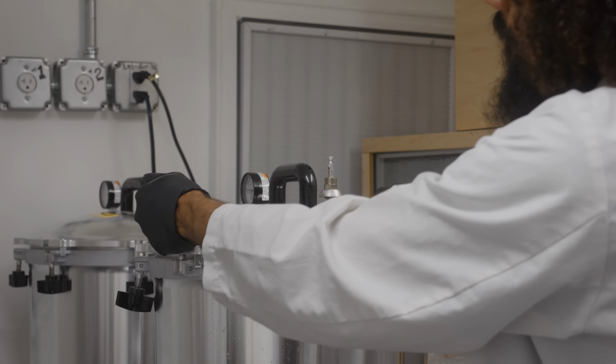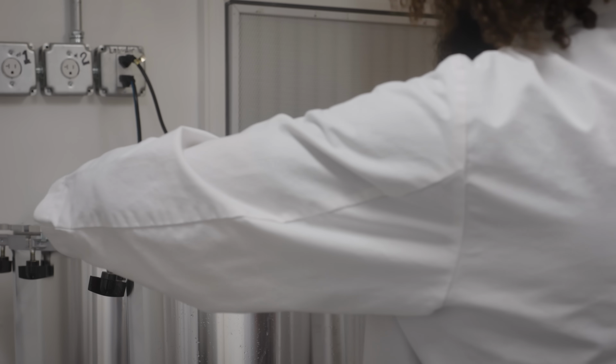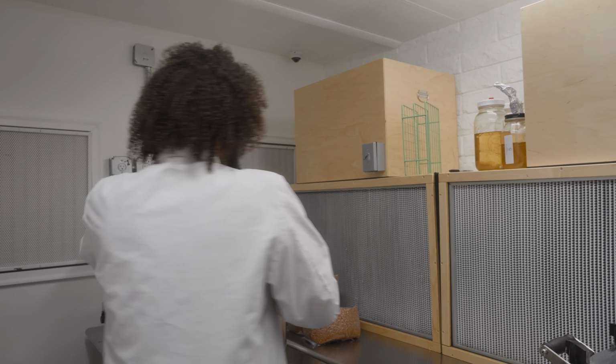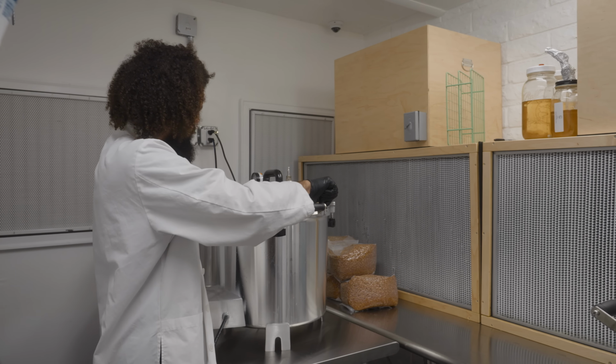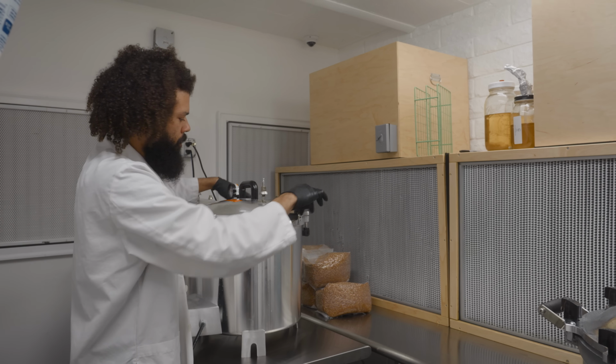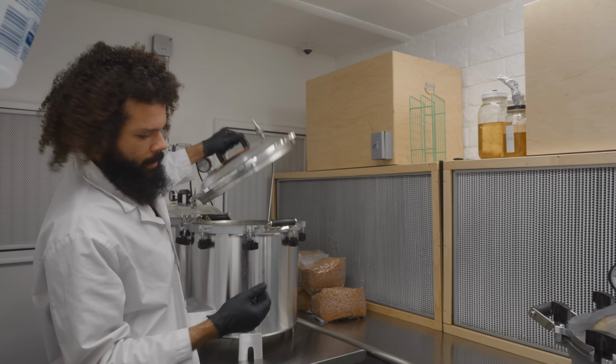So we're sterilizing about 50 pounds of grain in each of these sterilizers. With 3 of them running, it gives us about 150 pounds of fresh grain. And we could just use that for, like I said, Generation 1 bags. We also like to use these for making liquid culture or agar media.